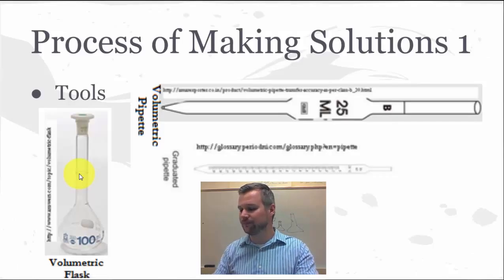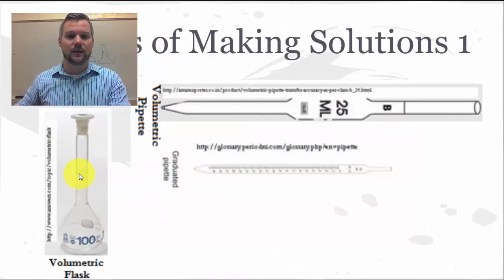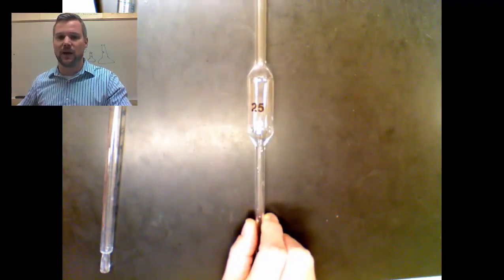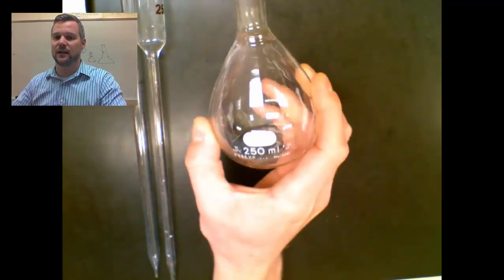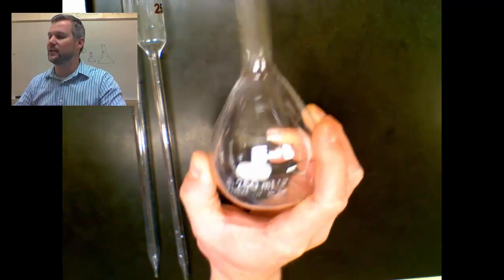Here's an example of a 25 mL volumetric pipette — if you look closely, there's a brown striped line on the pipette that's the 25 mark. Then we have the graduated pipette, which has a lot of graduations on it so we can measure many different values accurately. And finally, the volumetric flask — this one happens to be a 250 milliliter volumetric flask, and there's an etched line you can see on the neck of the flask.